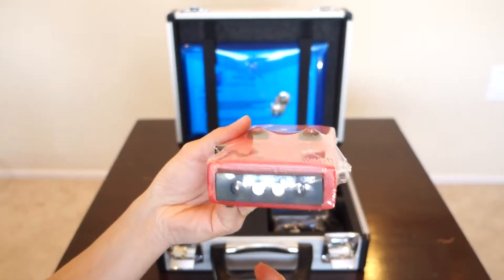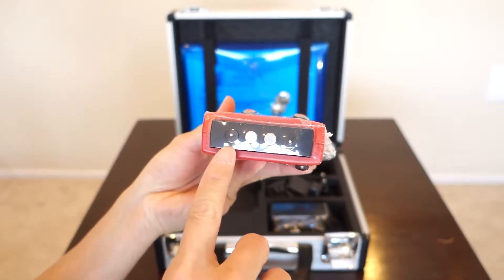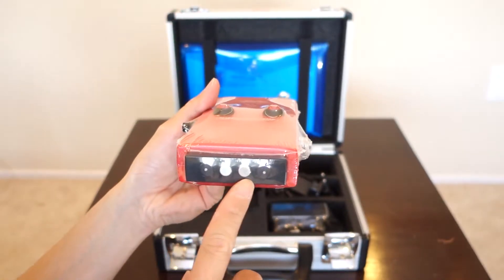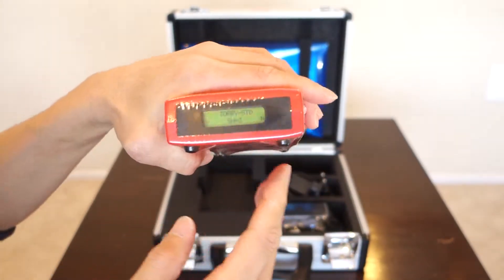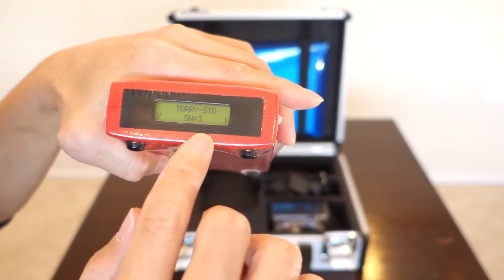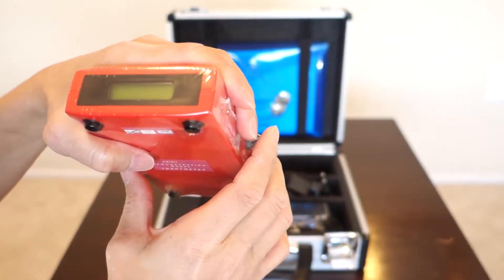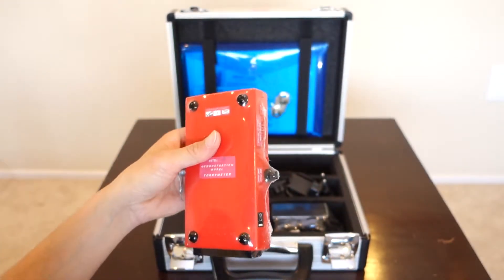When you flip it to this side, this is where the actual measurement takes place. It's got these leads here where you can put it on the fish and it gives you a reading of how fresh the fish is. I accidentally pressed it on, so it's got a menu and LED display — you can already see it's working. I'm going to turn it off now. It's very light and very small.